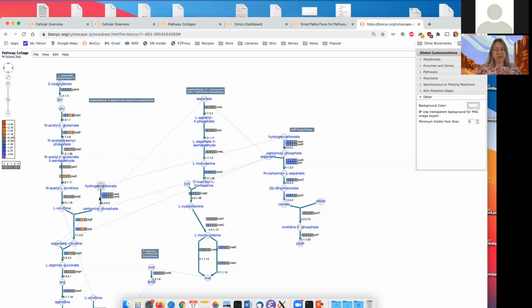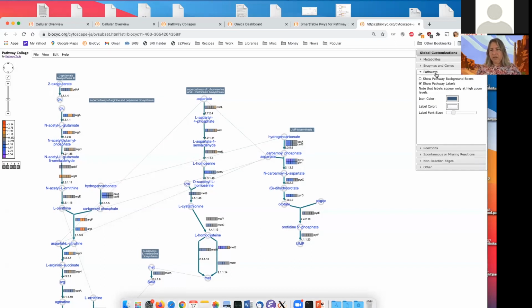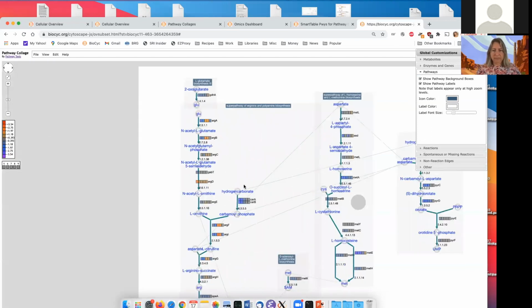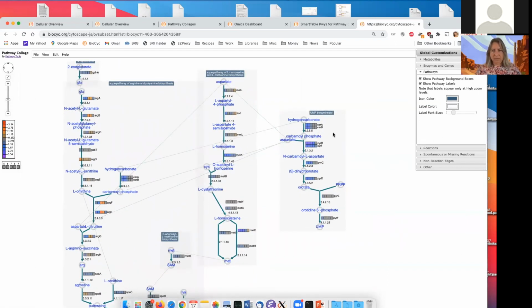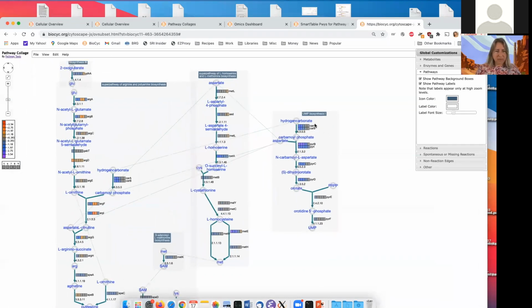For example, right here, we have a duplicated reaction. I'm actually going to merge this. Actually, I'm going to move things around first so it doesn't look quite as ugly. Oops. Okay, it's not moving. Not quite sure why that is. But okay, let me do a merge here.